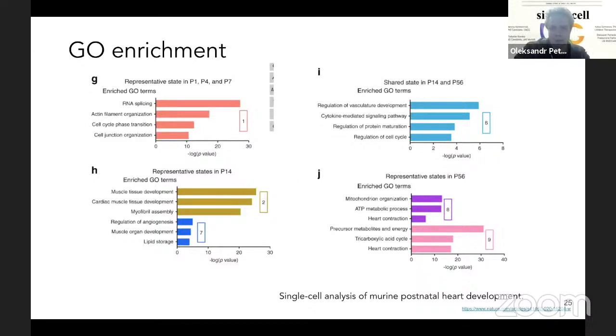Because if you're a bioinformatician, there is a big chance that after you process your data, you will have to go to the lab meeting and meet the biologists and explain, okay, so in these cells, we have these pathways or these biological terms, in this case, over-enriched. And in this case, they can understand you.